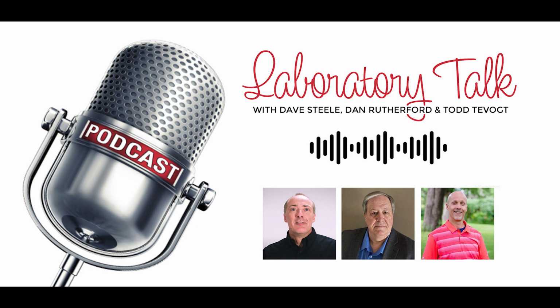Yeah. So there's another term that I've heard, hard vacuum. What actually is hard vacuum? Well, that's one of those sort of fuzzy terms that isn't really well defined. I tend to agree with the definition that it's something better than a 99.9% perfect vacuum. So something in the single millibar or torr range, 1 or 2 millibar or 1 or 2 torr.